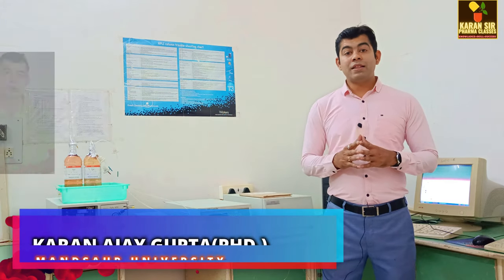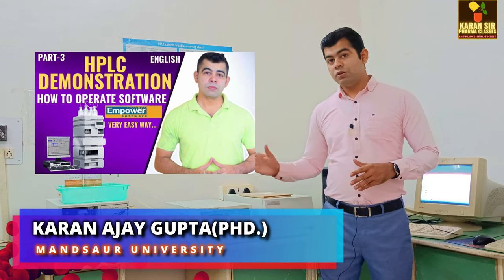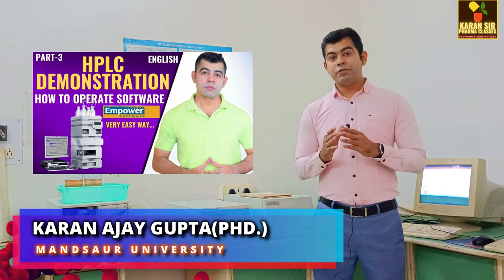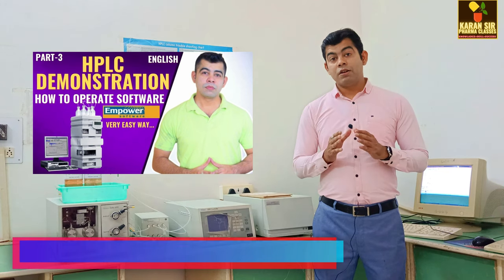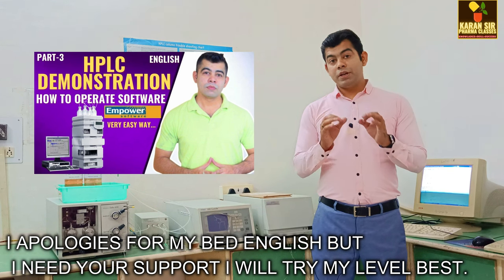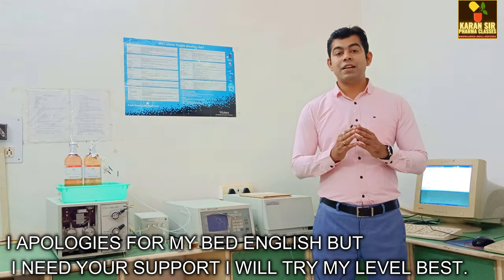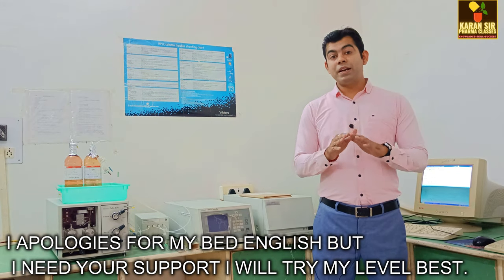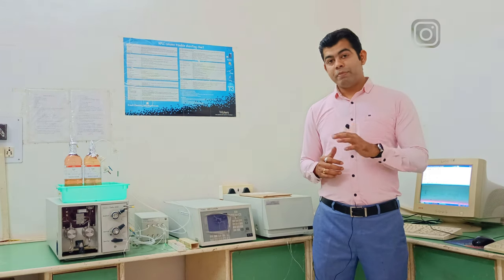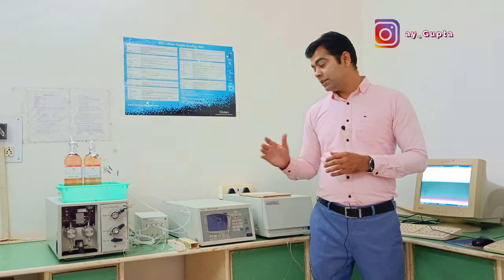Okay, so the method for caffeine is completely prepared in our software and we give the command to our system. Before giving the injection to the system, first we have to check our pressure. Pressure must be 2000 to 3000 PSI. If the pressure is not maintained, we will wait and check the reason behind this. When the pressure is completely maintained, then we run our sample. Okay, so our pressure is completely maintained, so we give the injection to our system.